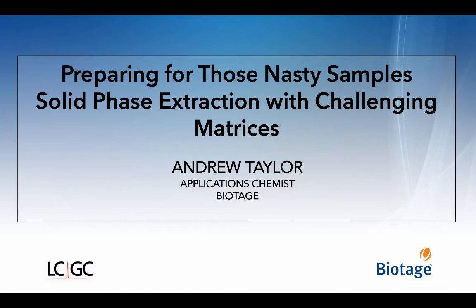How do you know how many pre-filters you should use? That's a great question. This is actually something that can only be determined by trial and error. I always like to err on the side of caution the first few times I'm running a dirty sample. It's better to have too many pre-filters than not enough, and you can always back off on the amount later on.